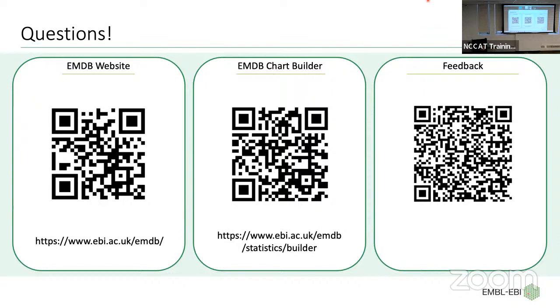Are there any efforts to make AI get metadata from some of these uploads? There are so many fields when you're uploading data, and there's this energy barrier when someone doesn't understand the drop down. Like there's 10 options, and sometimes you go look in the header and it says it's a half bit. That's not a choice. And there are some things that will auto populate, and those are great.